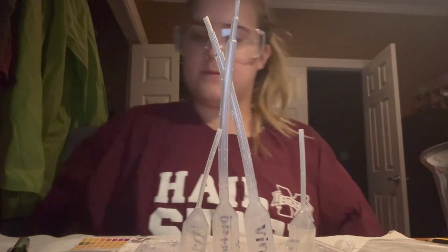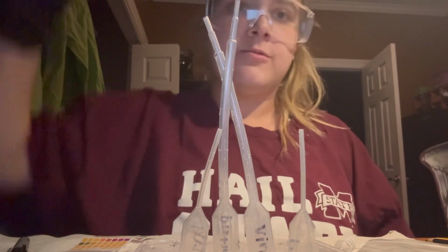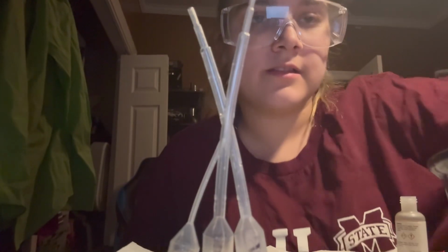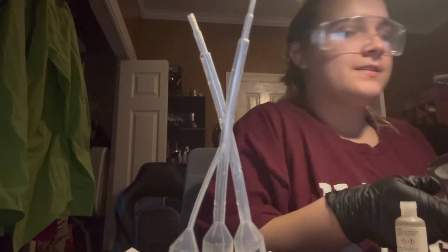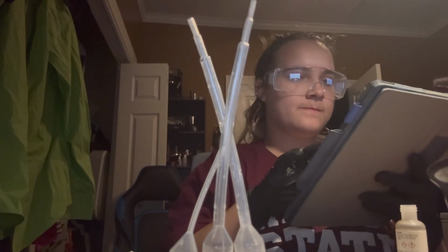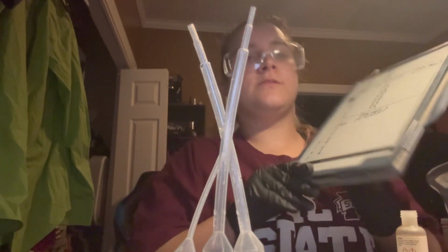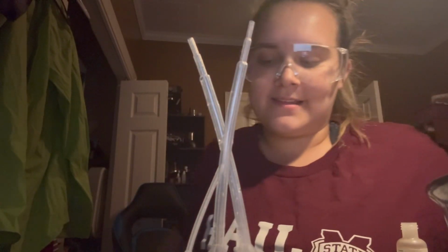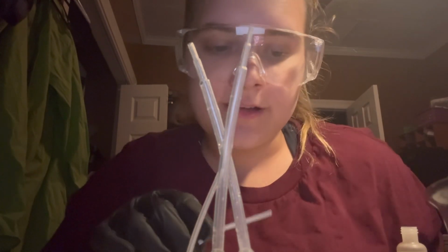I'll show y'all the results for data table 2 once I'm finished. So here are my results from data table 2. And now we will do the stuff for data table 3, which involves the B1 well. So first we take the pH of the B1 well.